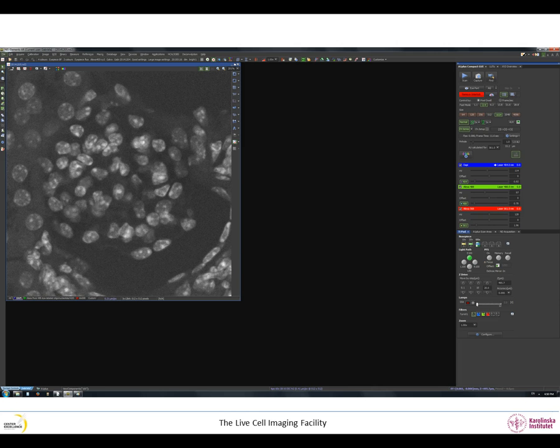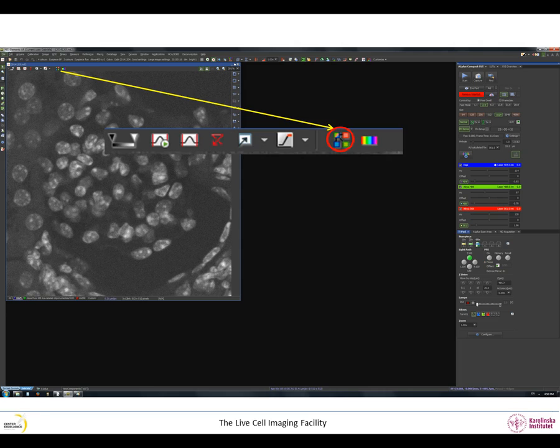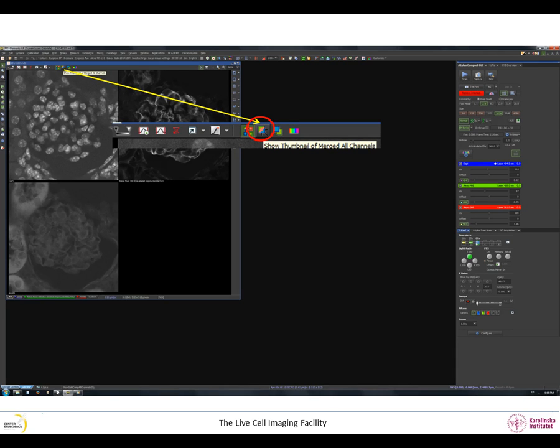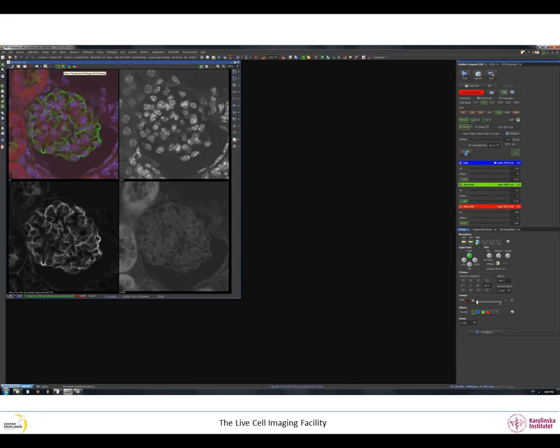Now you have acquired some images. At the top of the image window, you can find the Split Components button to split the image into individual channels. The button next to it allows you to add the overlay of all your channels.